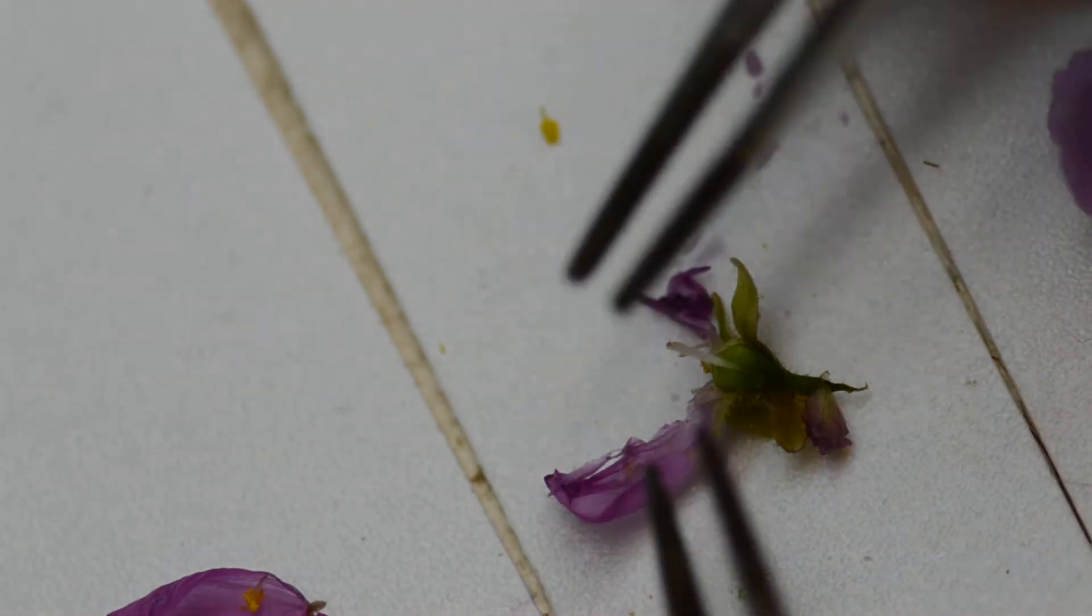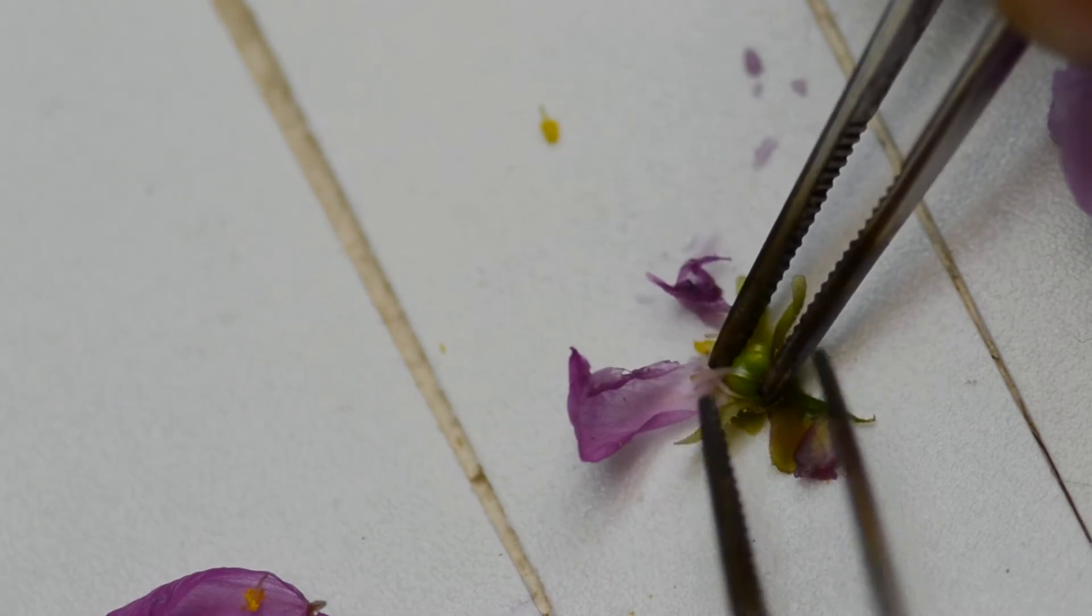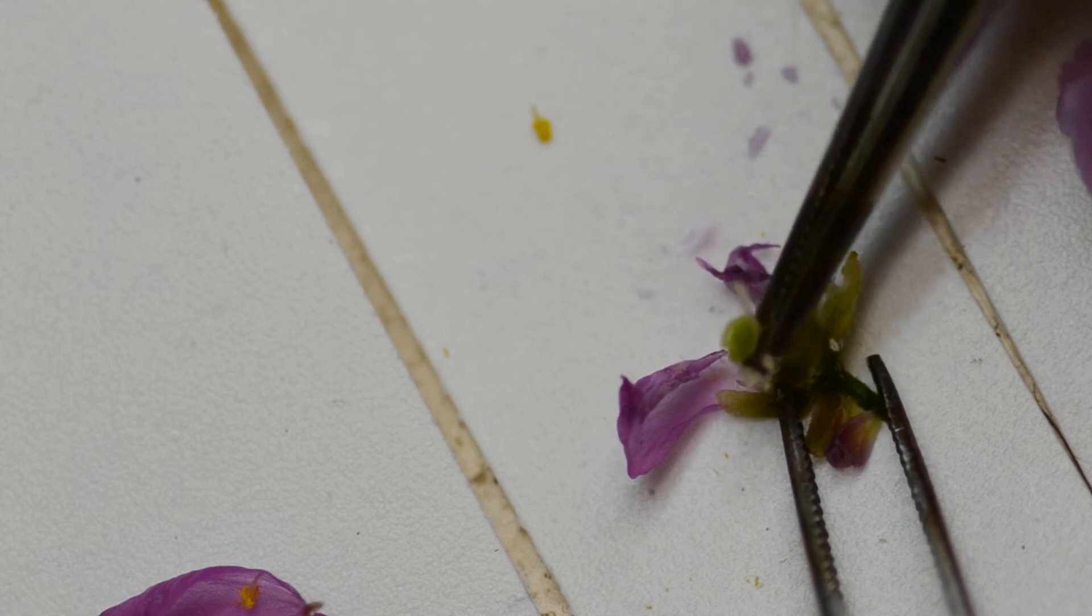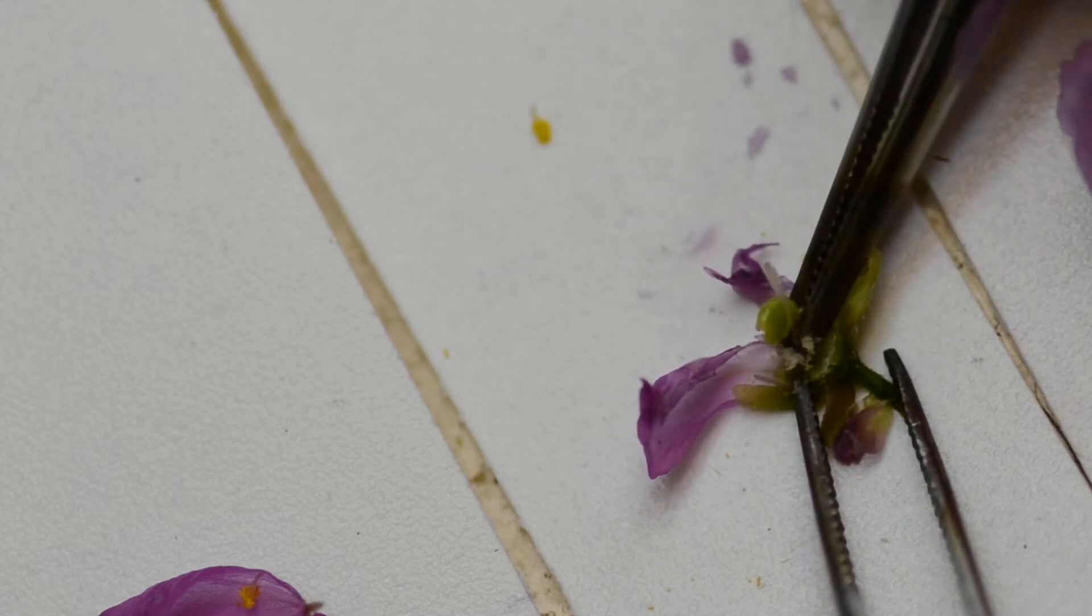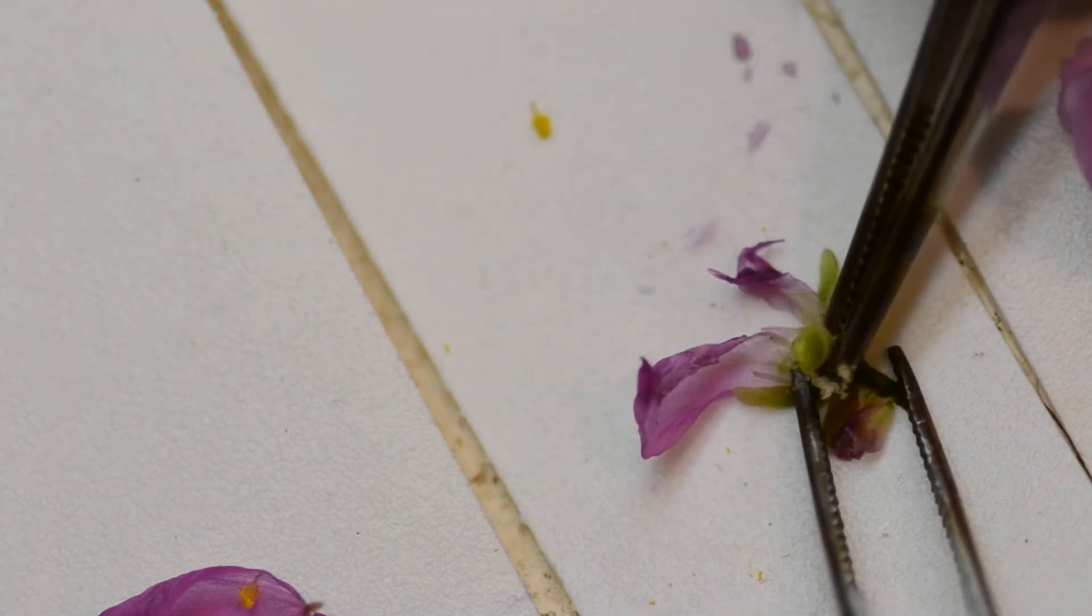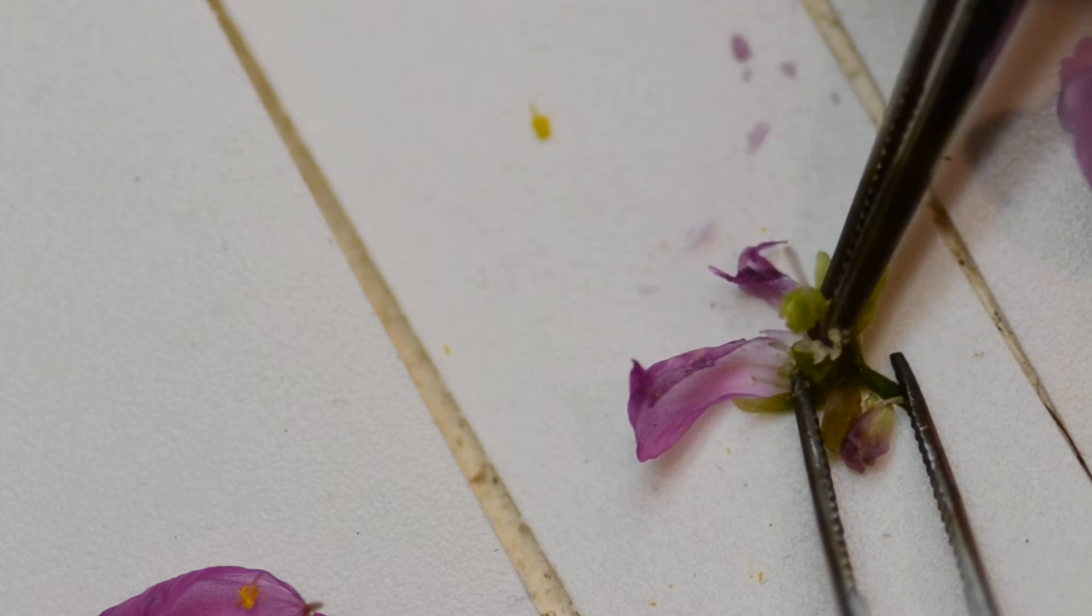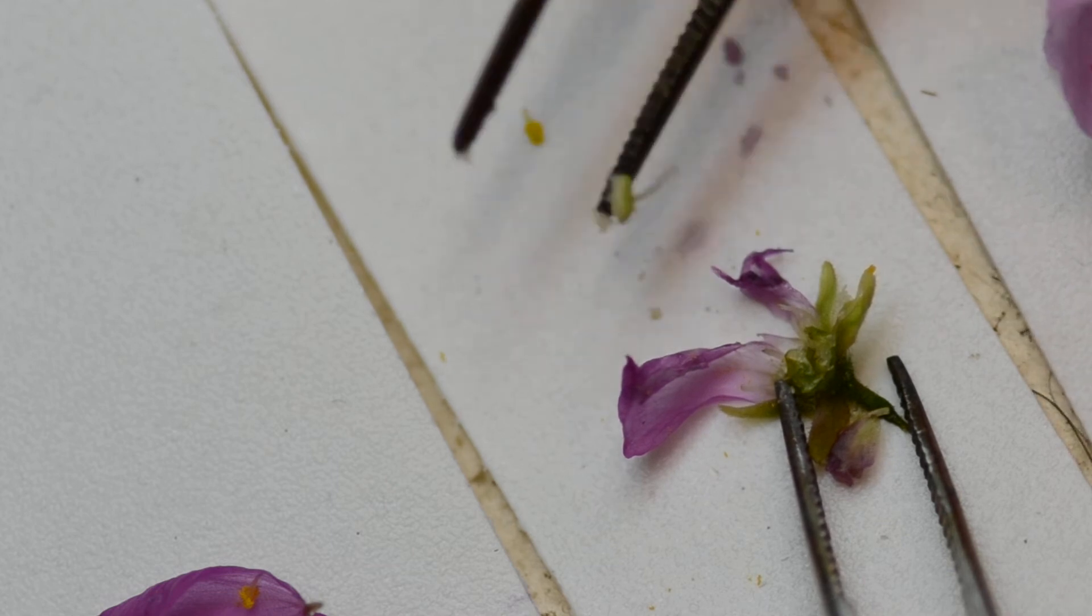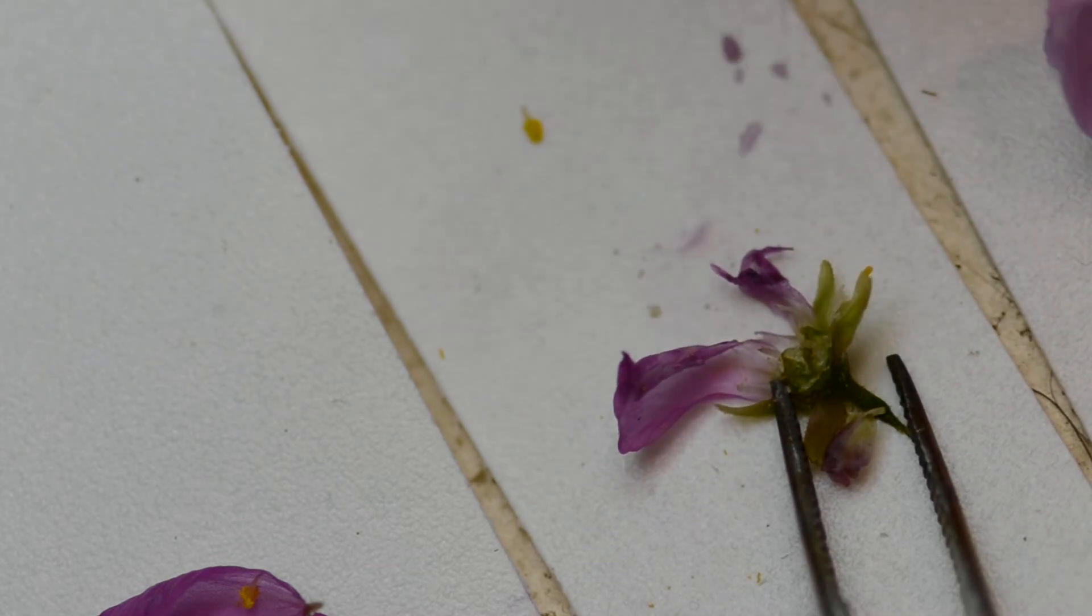So if we open up the ovary, we will be able to see some seeds, or eggs, unfertilized eggs, these little white things. So those are developed in the flower way before it ever gets pollinated.